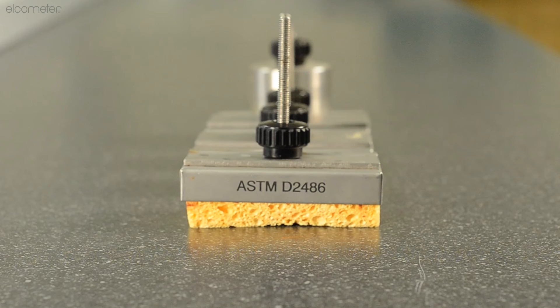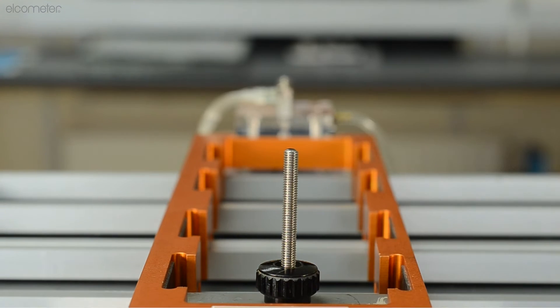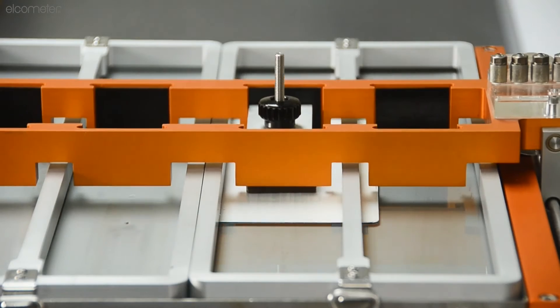The selected tool or tools are then placed into the carriage. The start button is pressed and the test begins.